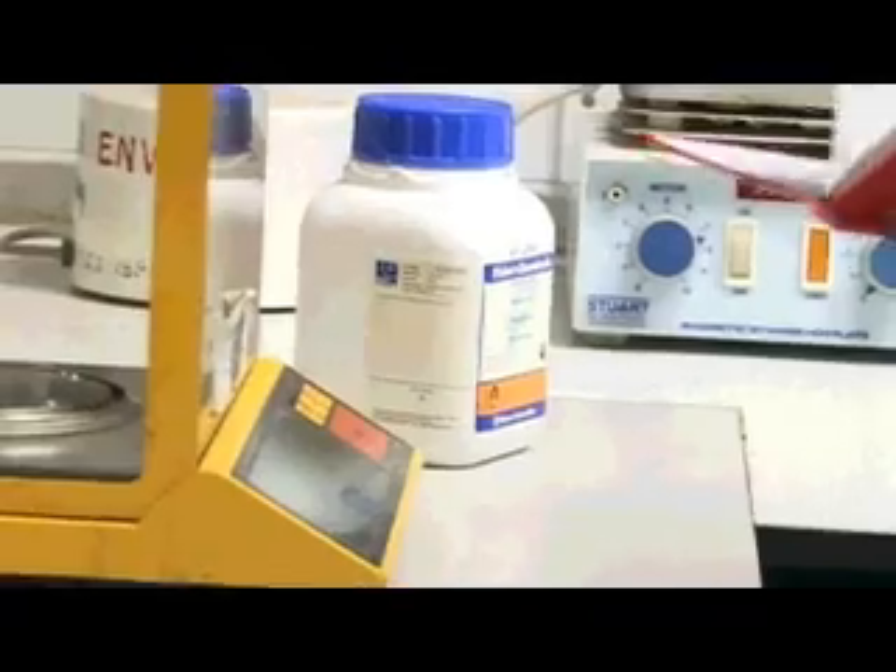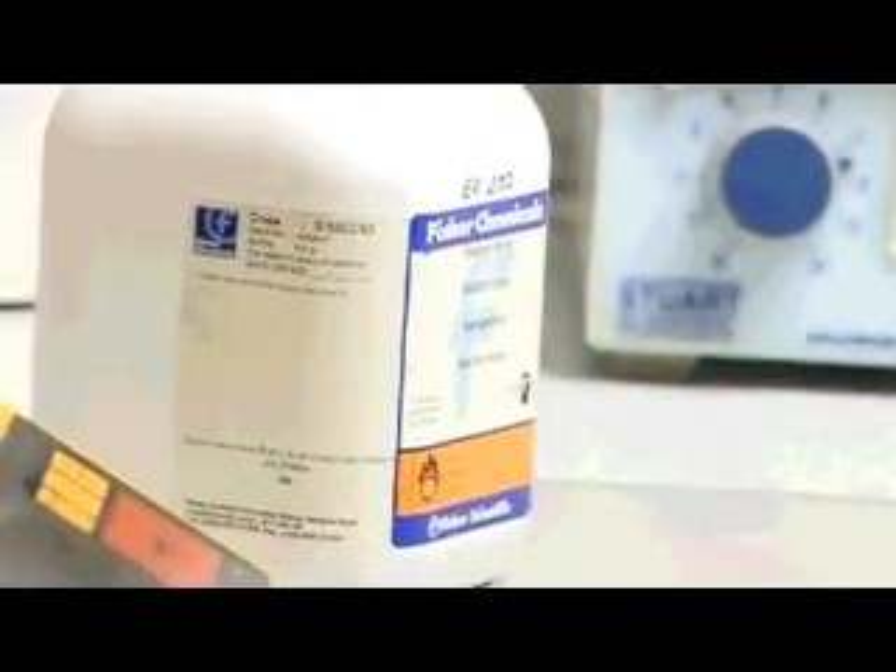It's the new lab rules that you have to wear lab glasses. The balance I'm using is particularly accurate — it takes it to four decimal places.